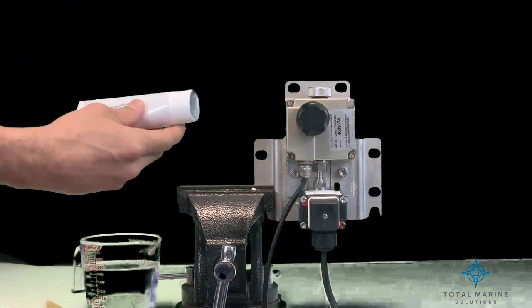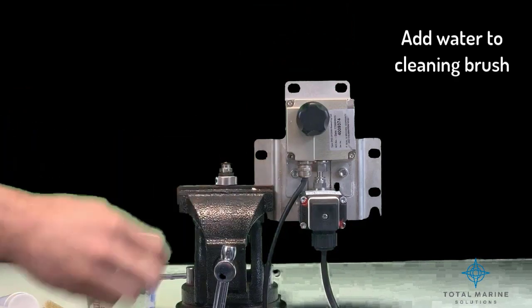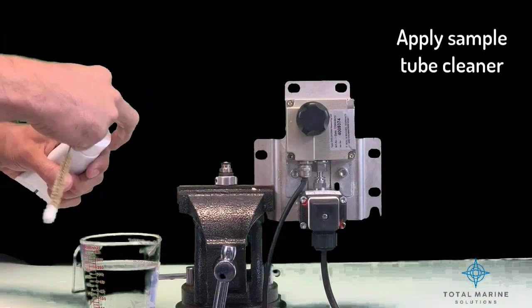Remove the cell cap, add water to the sample cleaning brush, and apply clean sample tube cleaner to the cell cleaning brush.